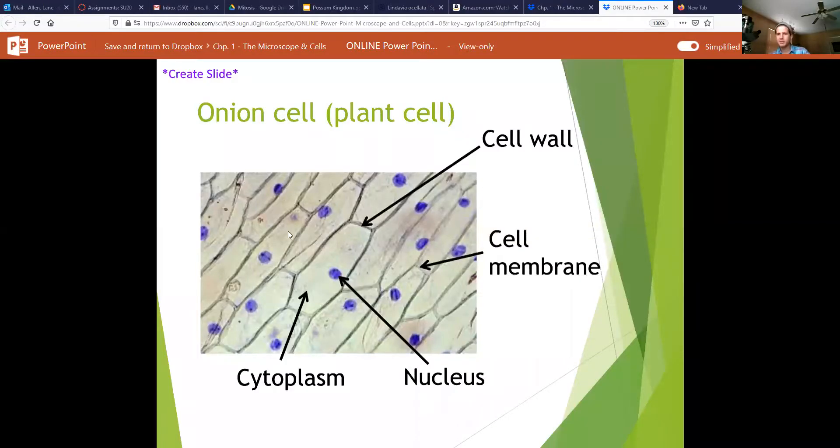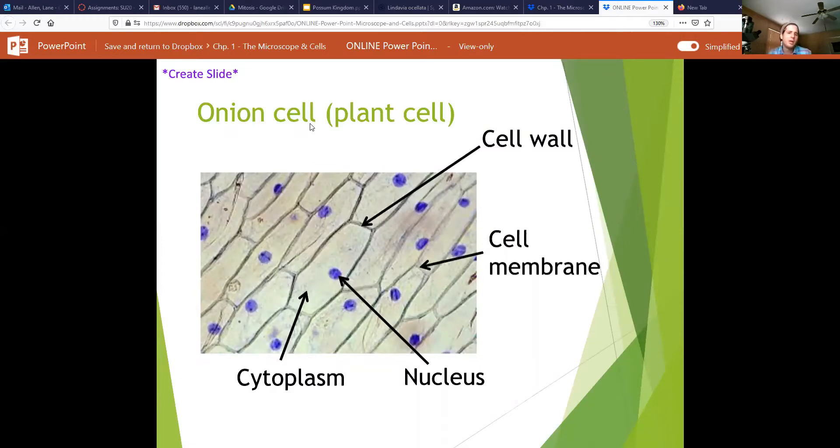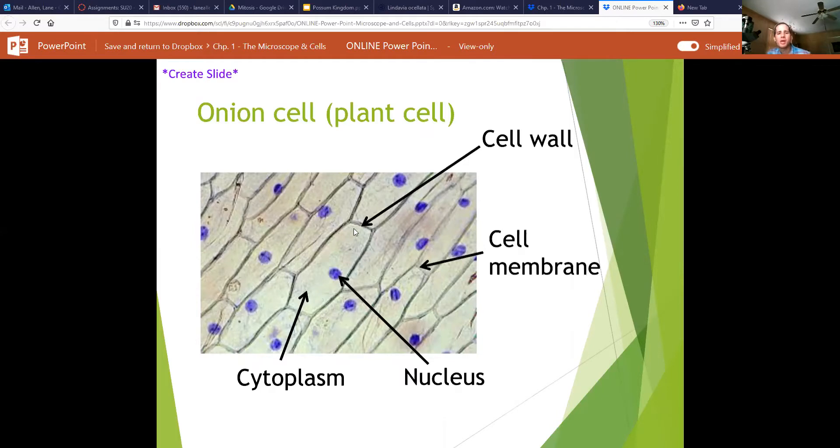All right, let's go to our PowerPoint real quick. So here is an image of our onion cell, and the features that you're going to be looking for on this onion cell are these.